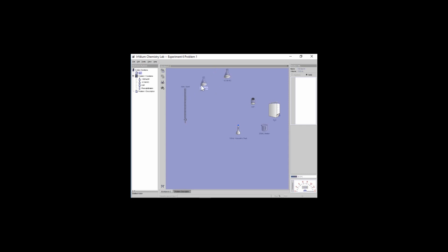So I'm going to drag the Erlenmeyer with the unknown NaOH over the burette. If you need a funnel, you can pour that in that way. I'm going to pour in, let's say, 40 mL. Again, when I have a good 40 mL in the burette, the marking on the burette actually doesn't say 40. With the 0 mark up here, I'm only up to the 11 mark here. I read this to 2 decimal places. Let me actually just track down this number here.